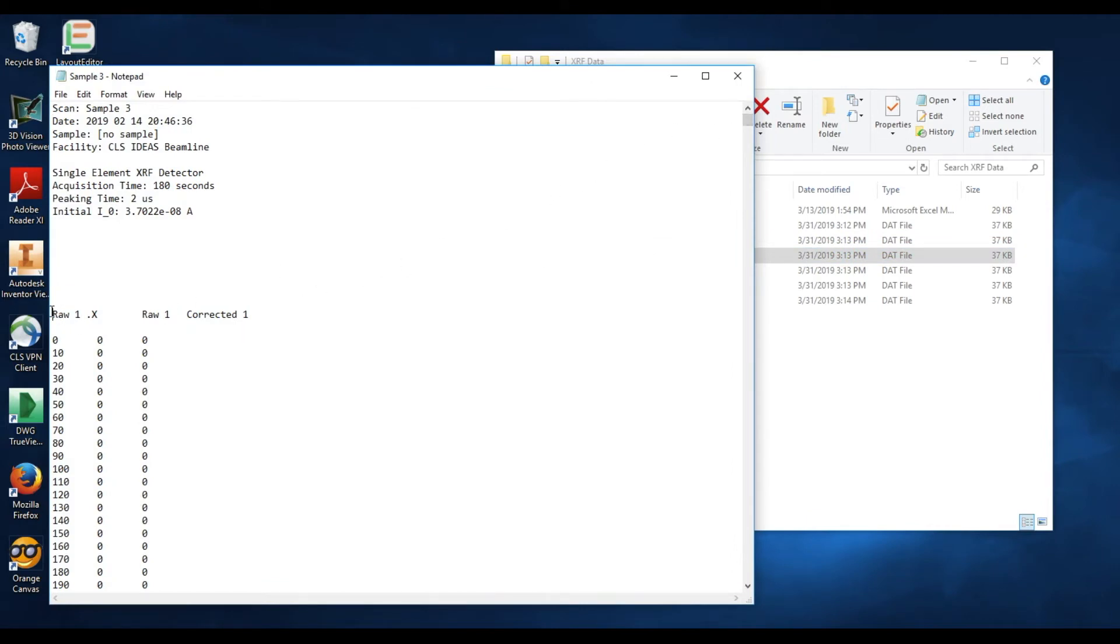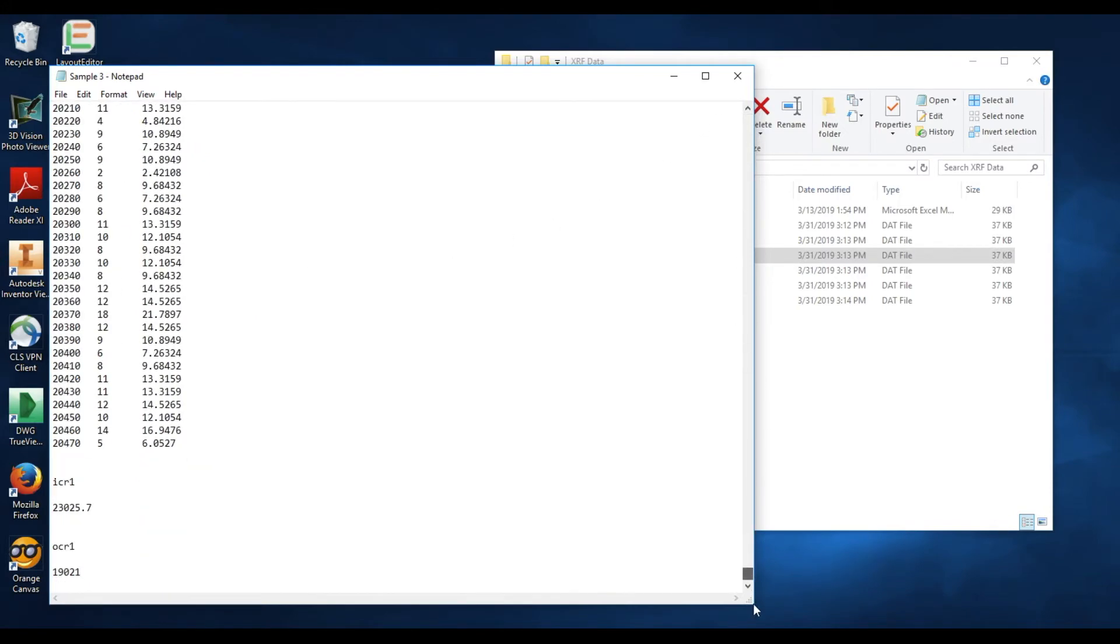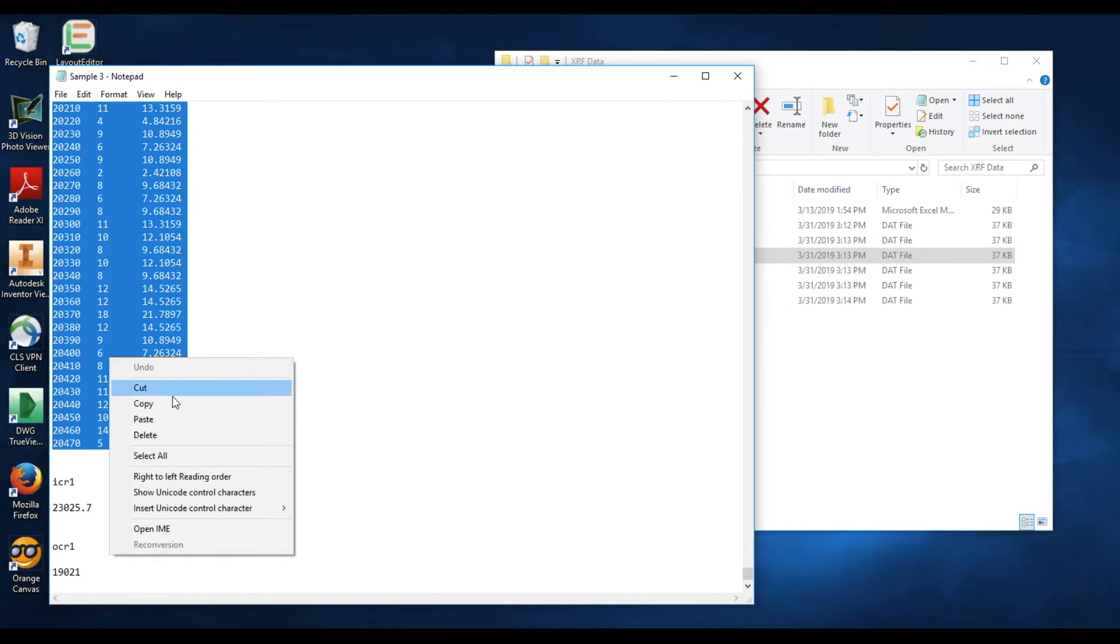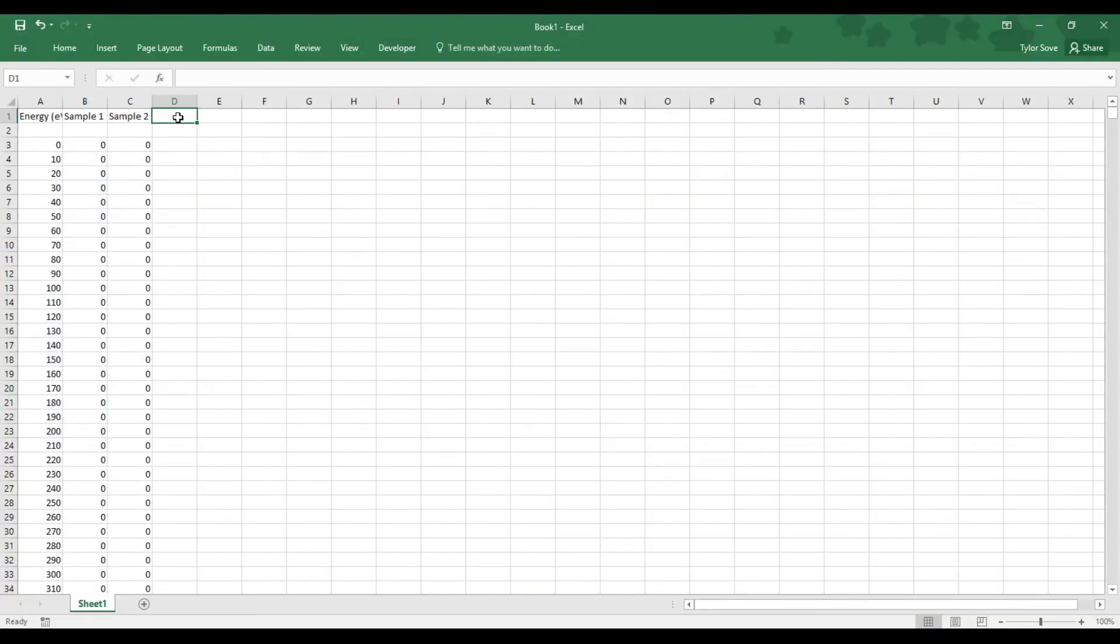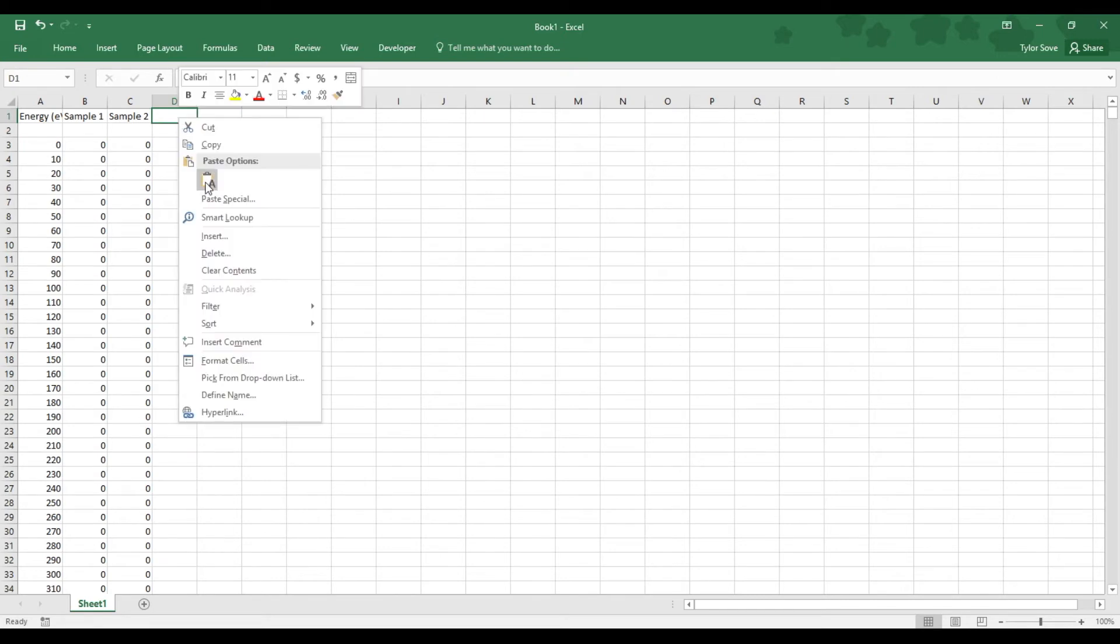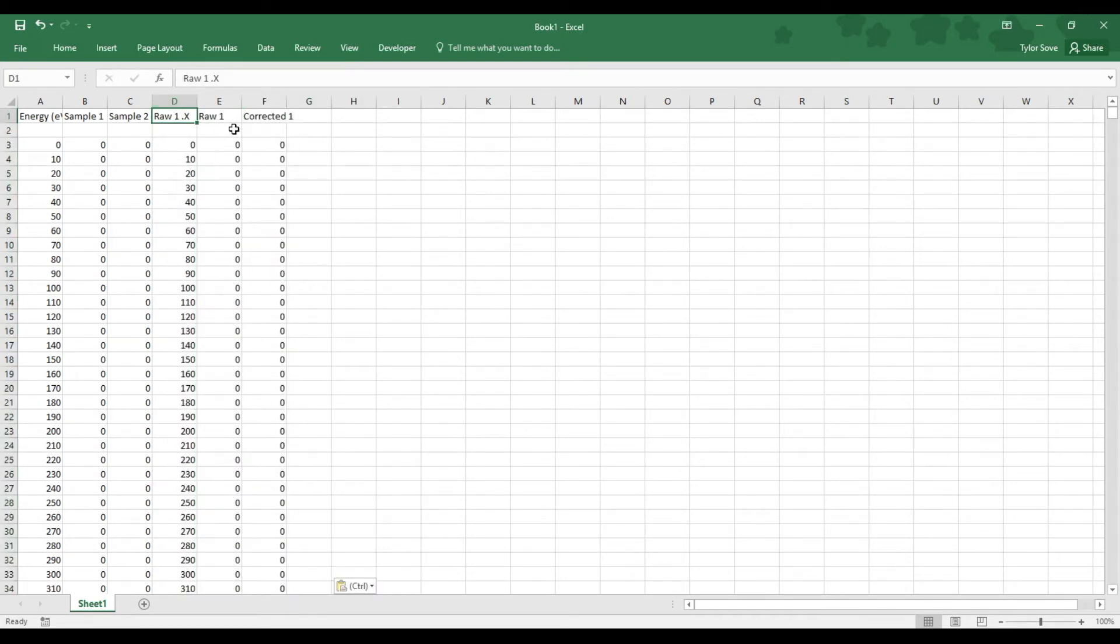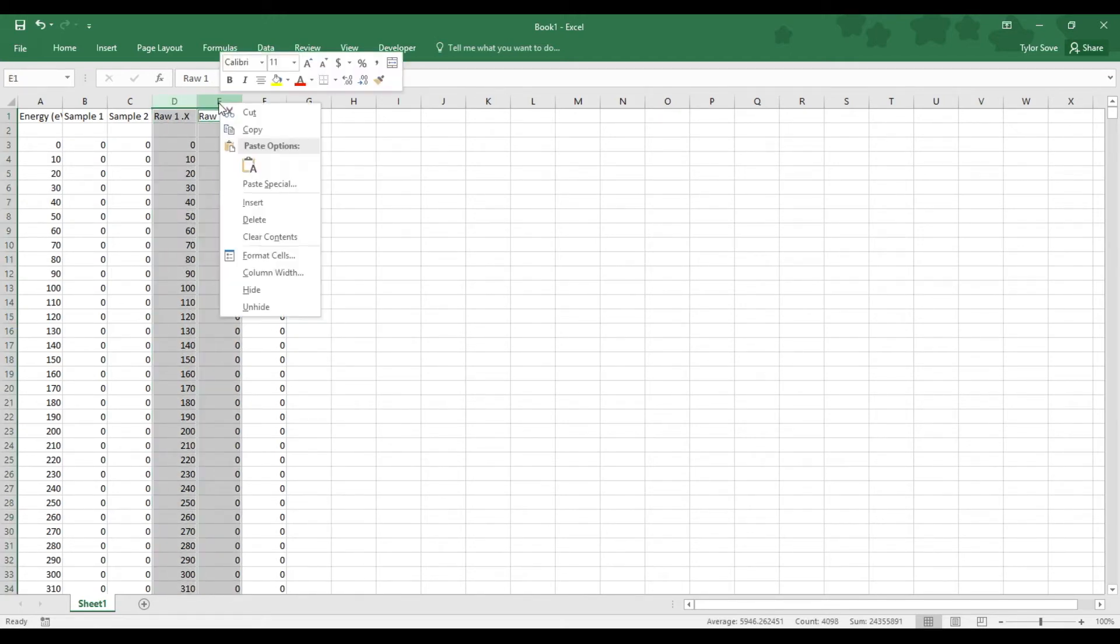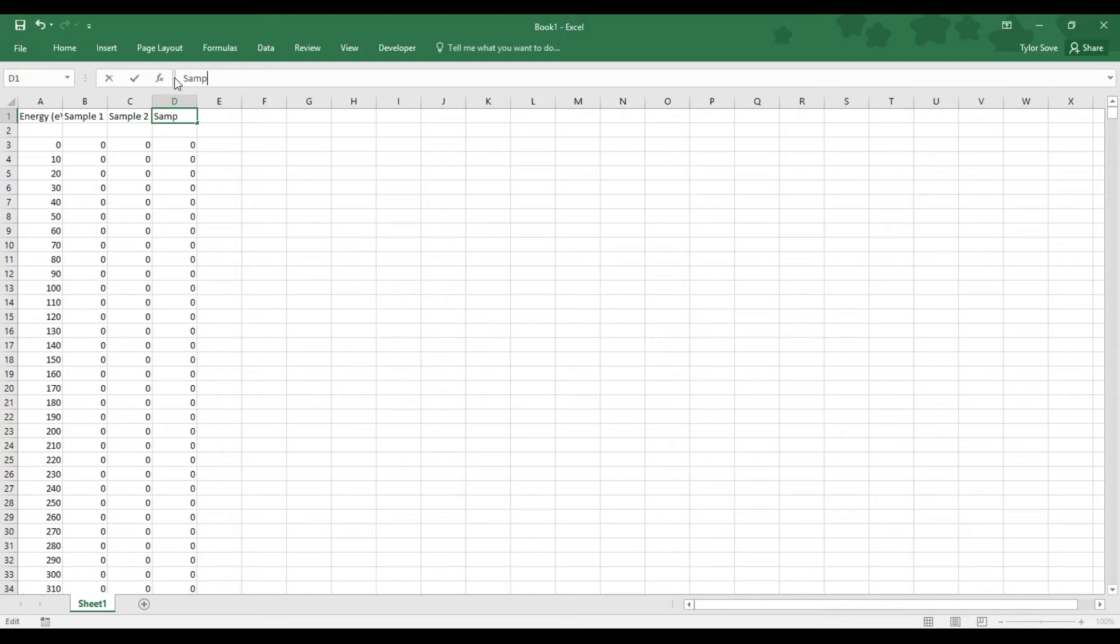Selecting just before the RAW1X again, scroll all the way down to the bottom, hold shift as you select the last data entry in the column set, ignoring the ICR1 and OCR1. Right-click it and select copy. Over to Excel, now this time in cell D1, right-click and select paste. Again, we'll get rid of the energy column and the raw data from the new sample set. Highlight their column headers and select delete. Rename that corrected one to the sample name.